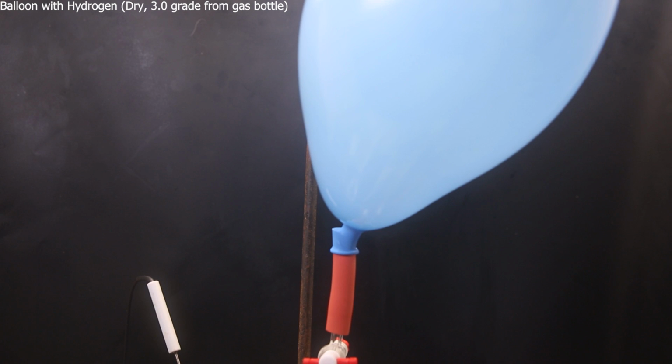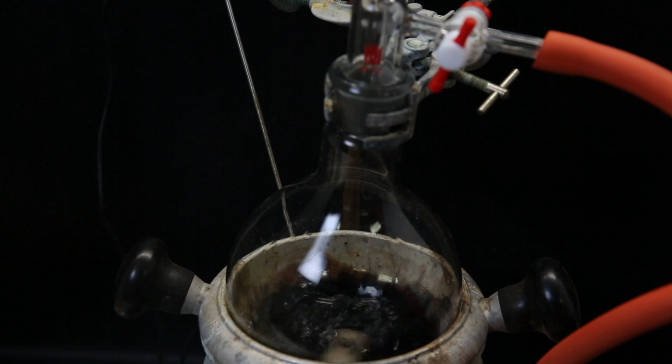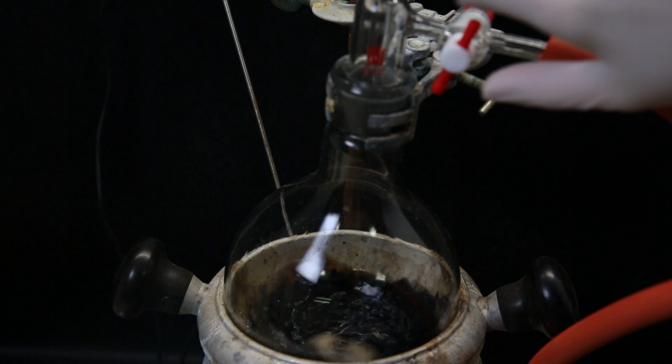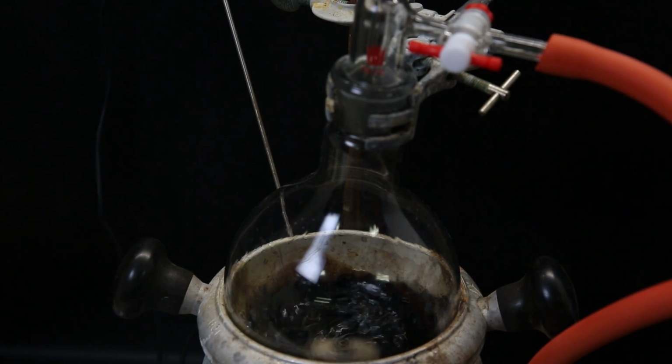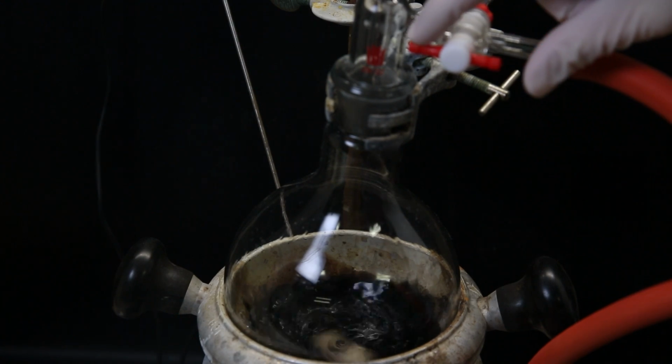I repeat the same process as before, but with hydrogen, which fills the flask with hydrogen and starts the hydrogenation process. I heat the flask to 45 C and I make sure to stir it strongly to knock the hydrogen into the liquid and increase contact with the catalyst. Since I can't be completely sure how fast and how much hydrogen the reaction consumes, I leave it to react for 2 days and occasionally repeat the pumping and hydrogen filling process.